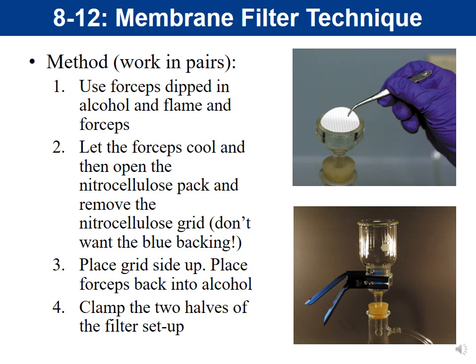So now I'm going to walk you through how we do this setup. The pictures that you're seeing on the right are the setup pictures from your lab manual. The ones on the previous slide are what our setup actually looks like for the lab, but the idea is the same. So this would be done in pairs. So per pair, you would test one water sample.